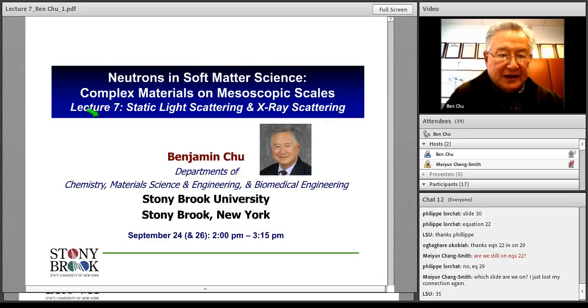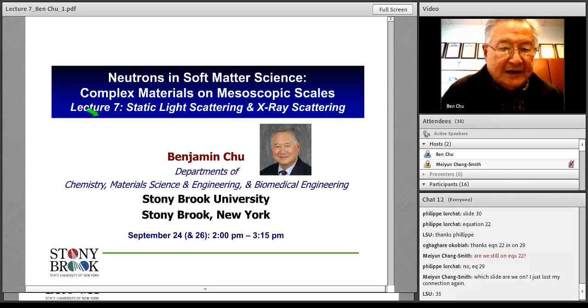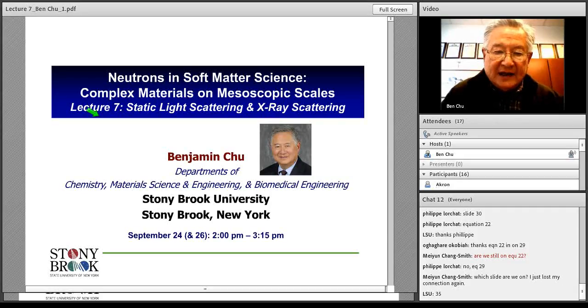There's this cylindrical cell, represented by a circle. In this particular case, you will see most light scattering instruments, at least for some precision, usually have simple optics, and these are the optics that I will show you. The others use fiber optics, but then it gets a little more difficult to explain.